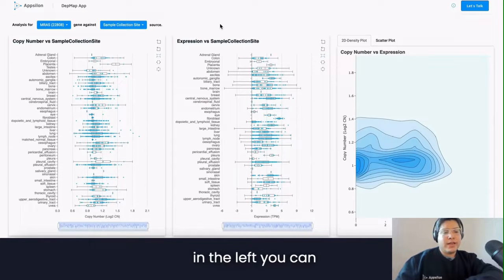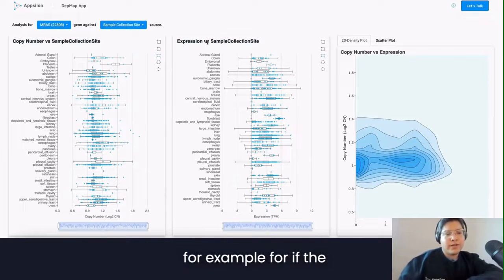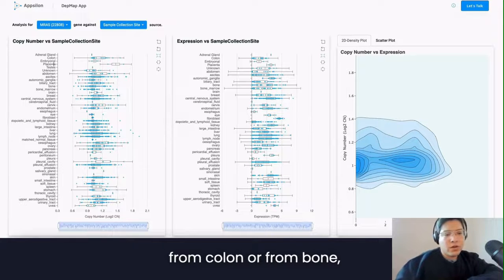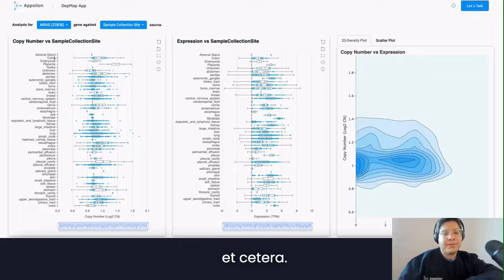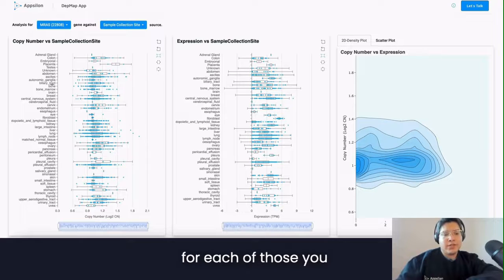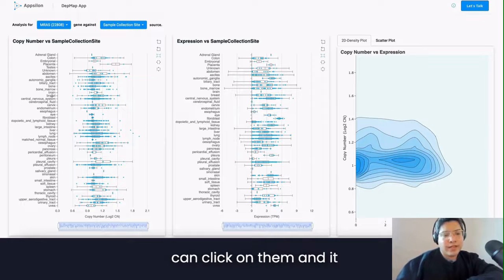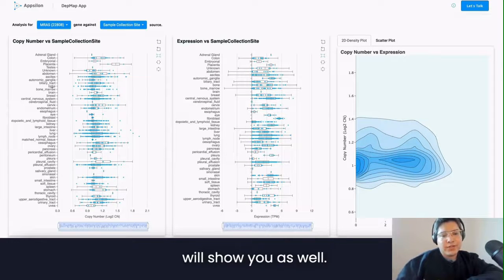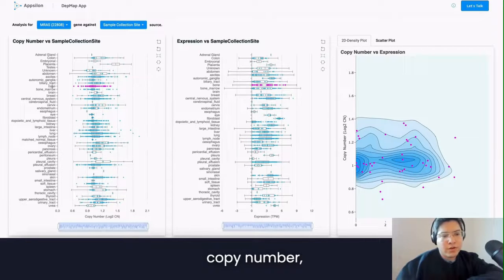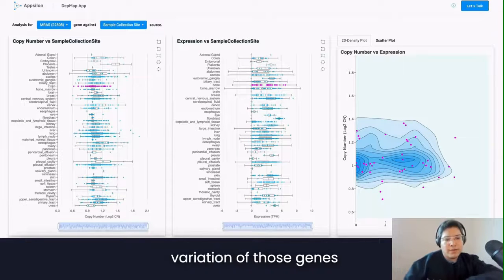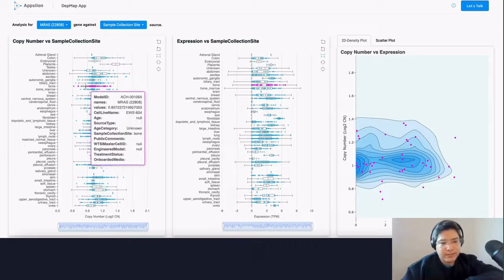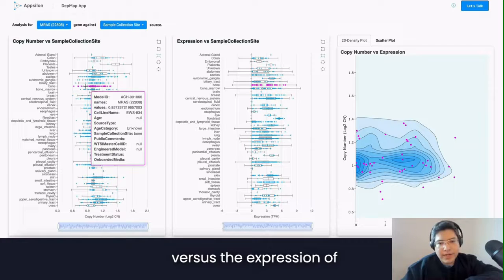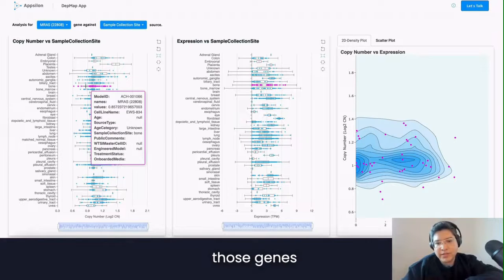On the left you can observe the copy number, for example, whether the sample collection was from colon or from bone. For each of those, you can click on them and it will show you as well. You can observe the copy number variation of those genes versus the expression of those genes.